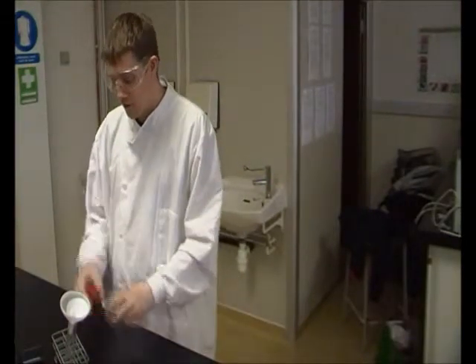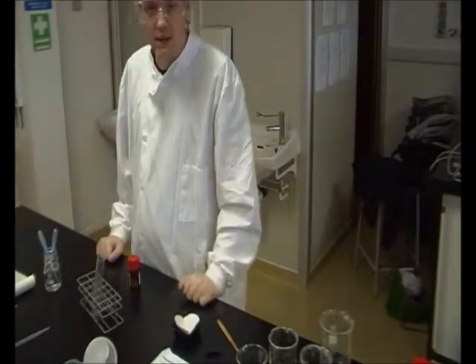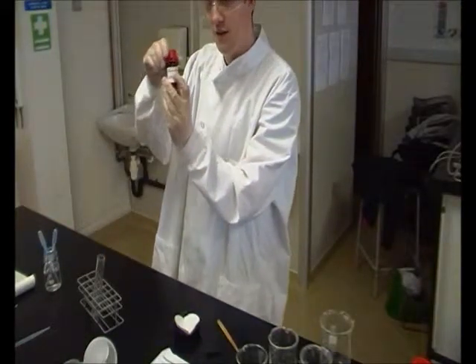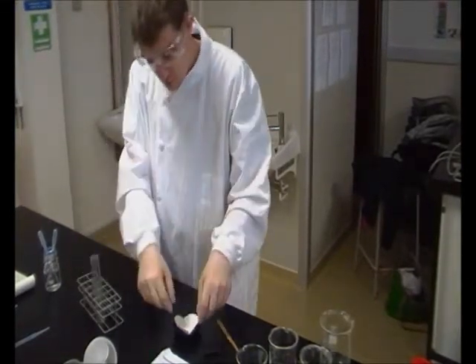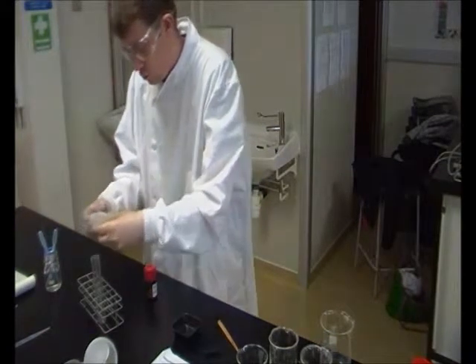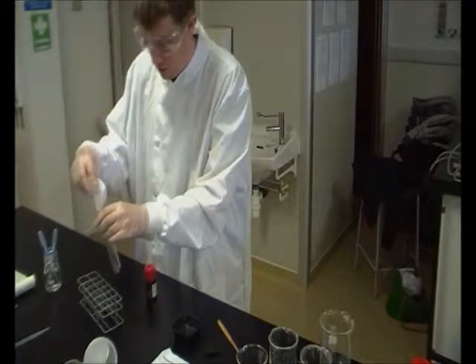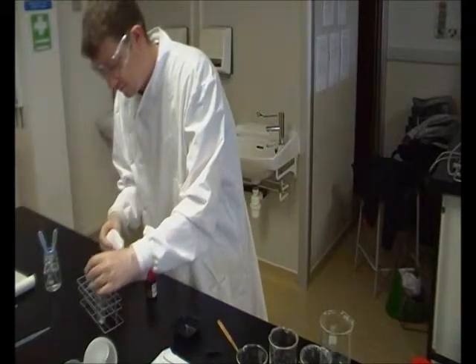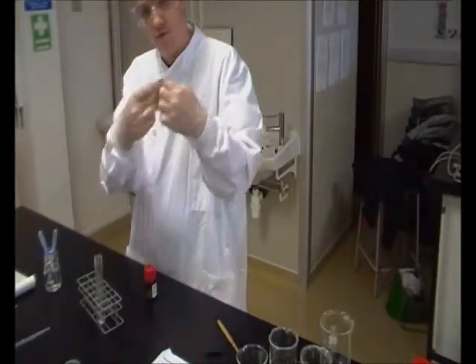The first step in making a synthetic dye is we need to weigh out 0.1 grams of this stuff — it's called 2-nitrobenzaldehyde. We're going to add that to a test tube. There we go, just use a bit of filter paper just to get it in there. That's 0.1 grams. We've got a piece of filter paper just inside of our funnel.